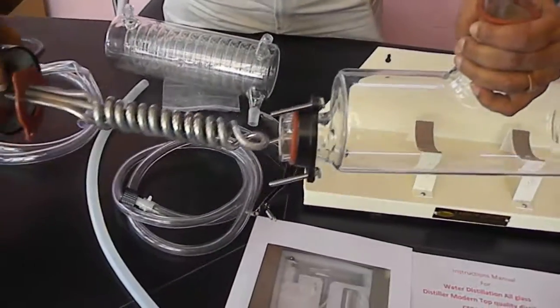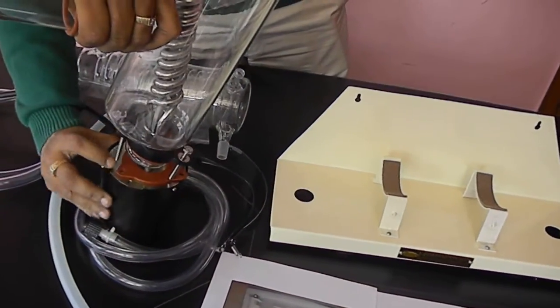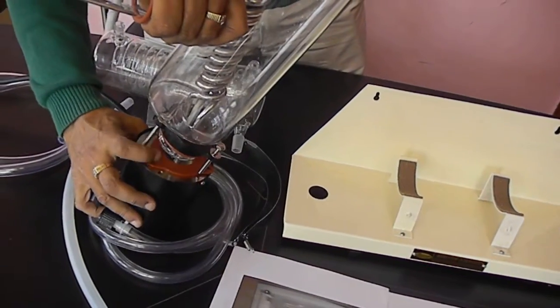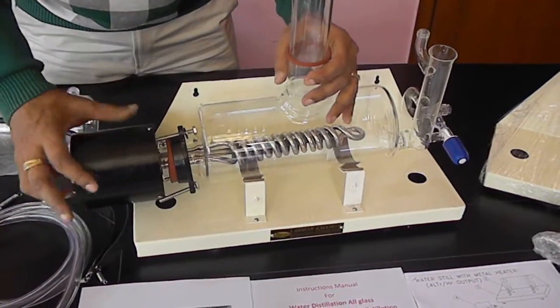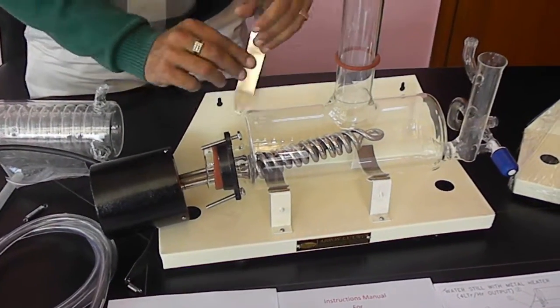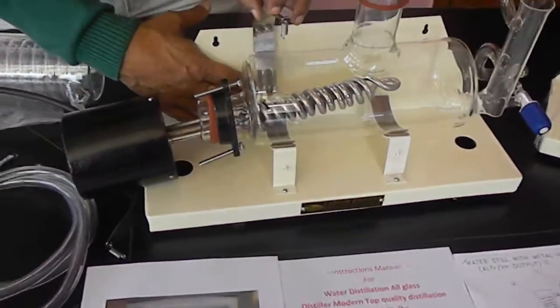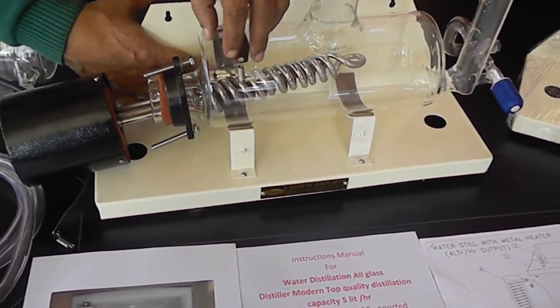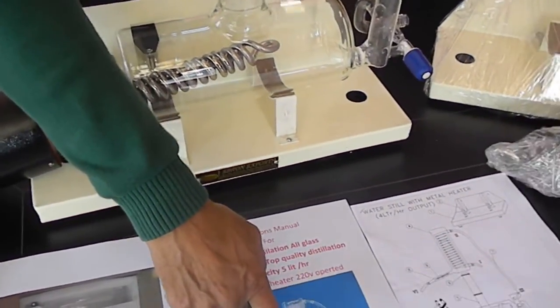Then this heater will go inside and we will fix the heaters on these three screws so that this secures properly and there is no leakage. Then we will put these clips which are on the back side. There is one clip here. These two clips will go and fix like this.